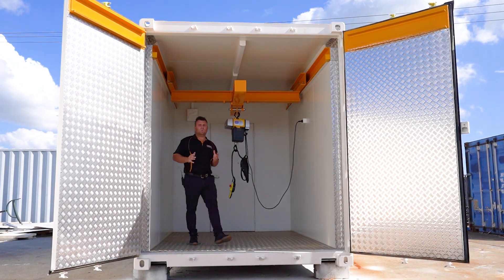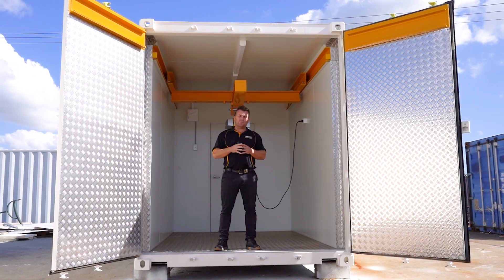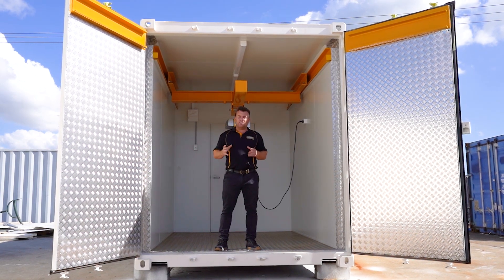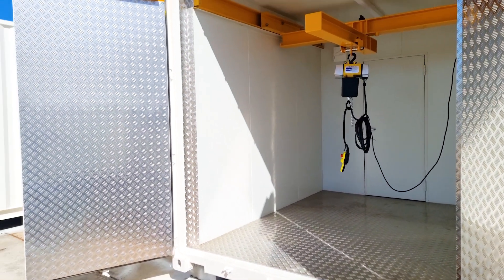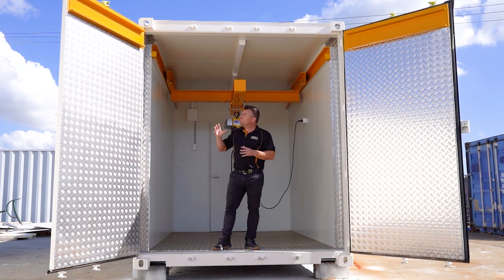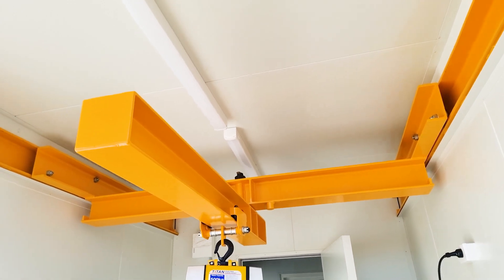This container will be used to bring in oil barrels and analyze them in the lab behind us. Obviously we had to build this very tough. You can see here we've put steel checker plate floor across the flooring as well as on the walls here, just in case these barrels come through and hit the walls — we don't want too much damage. We've integrated a fully engineered and approved overhead crane system as well.